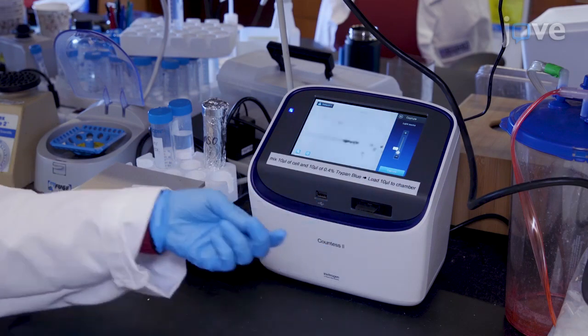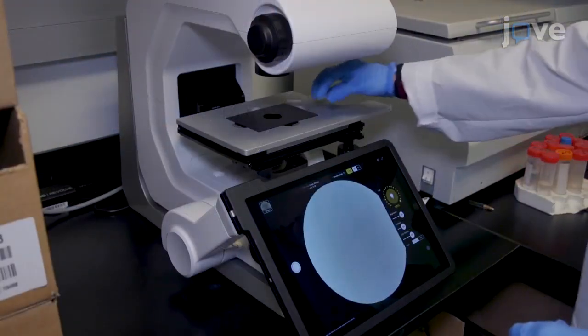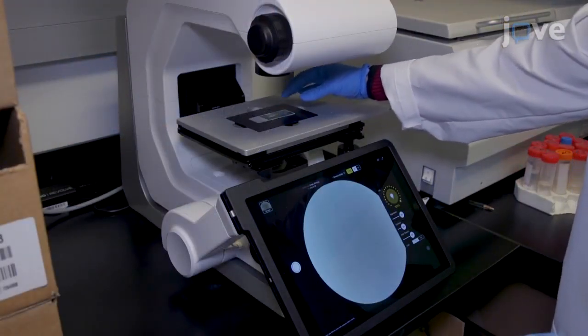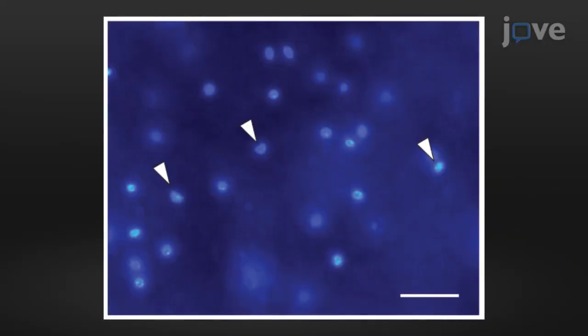Digital demonstration of this protocol is critical so that people who don't have much experience in handling adipocytes can replicate it and obtain insight into adipose heterogeneity.